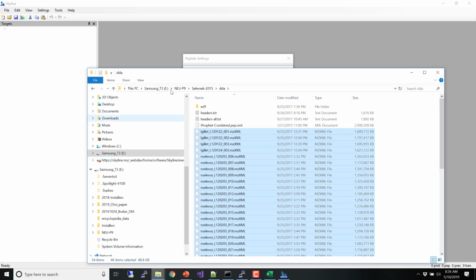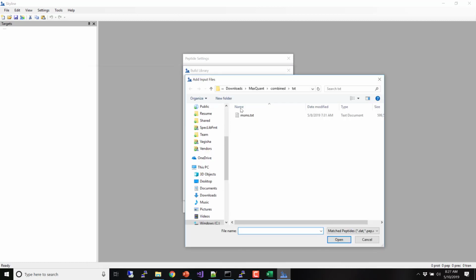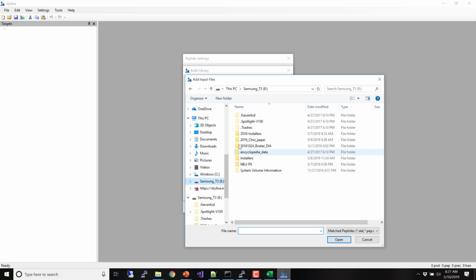So if you have 50 gigabytes extra and you want to take it home, I can give you these data, but it would have required an extra flash drive, and some people wouldn't have the space. And then I can just go and add files, and we'll see if it looks like it would go quickly enough for me to go through. But you can't follow along with this.